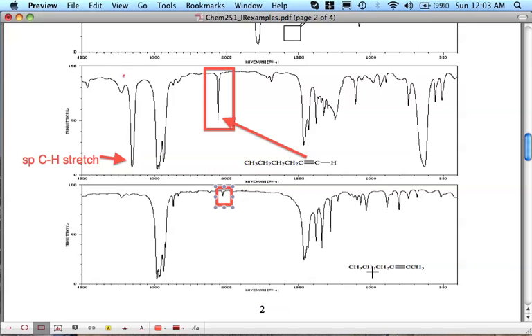Now, it's a little bit different having 3 carbons on this side versus 1 carbon on that side. But it's similar enough that there's not much of a change in dipole. Even with a triple bond on the end, there's often not that change in the dipole, so these are not super strong absorptions. So you have to be a little bit careful with symmetrical molecules. You don't see the C triple bond C stretch. That's also true for carbon-carbon double bonds. So if I had a perfectly symmetrical alkene, it wouldn't show any carbon-carbon double bond stretch either because there would be no change in dipole.